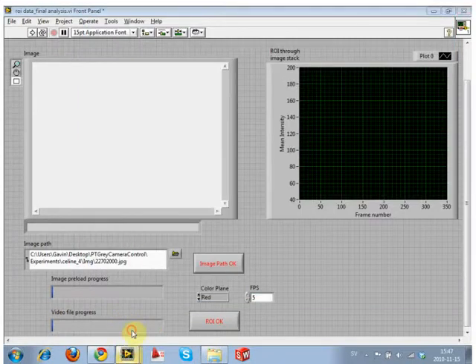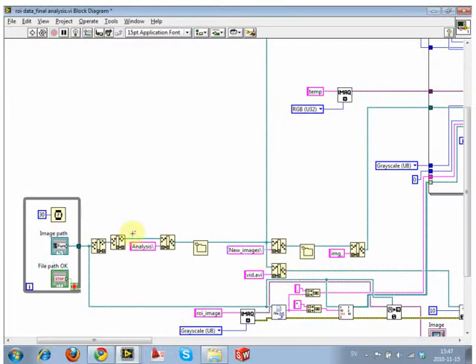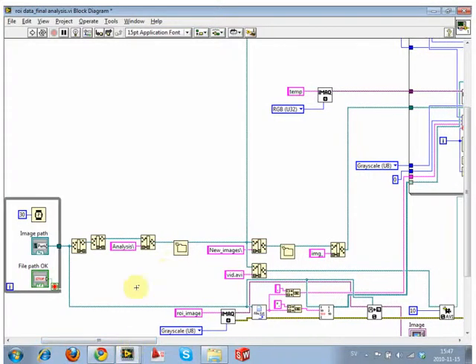Essentially building and stripping out everything so that we know where everything goes to and comes from. So that's kind of what we want to do first, is come up with a location to put all of our data. So I'll show you where all these parts are. Most of them you've seen before, maybe not the create folder VI, but all the rest are kind of standard.